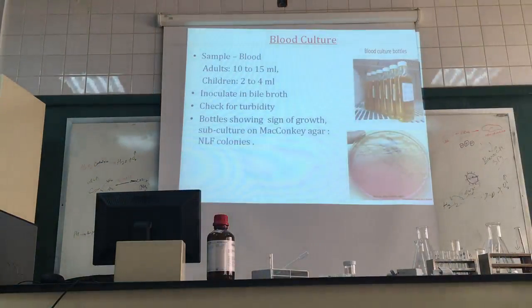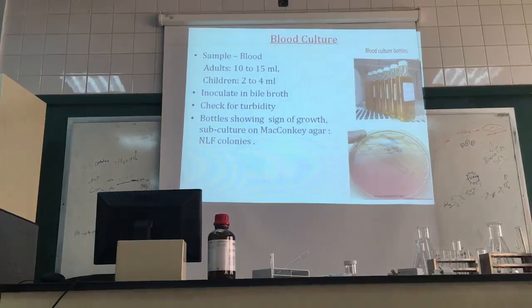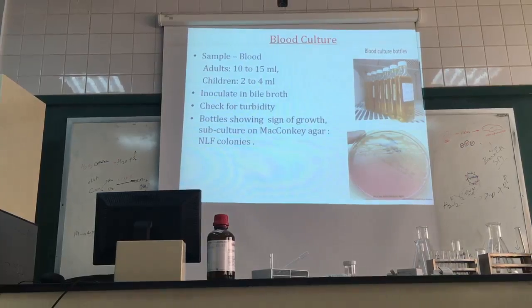Because the McConkey agar has a property: it inhibits the growth of all gram positive bacteria. Okay? When you put the Salmonella on the McConkey agar, the bile present in the McConkey will inhibit the growth of gram positive. This bacteria is gram negative, okay? So, after 24 hours, the growth will be seen as non-lactose fermenter.